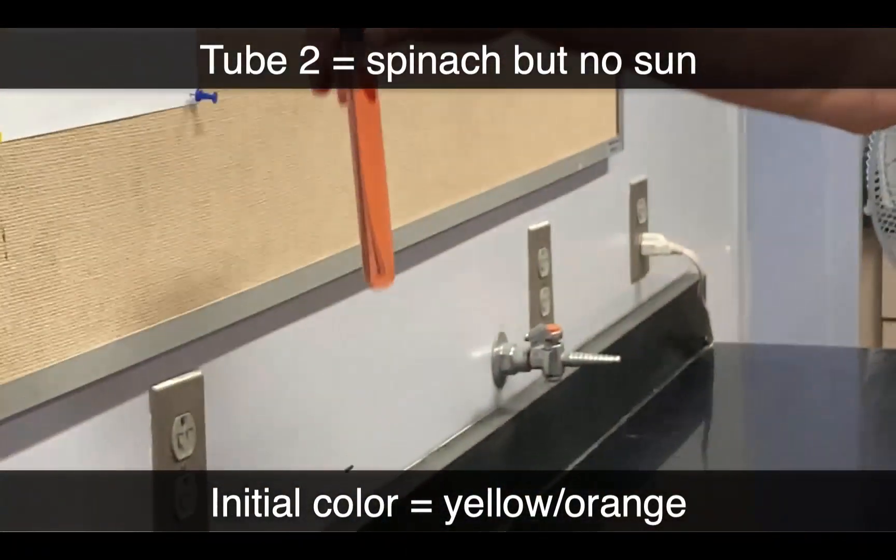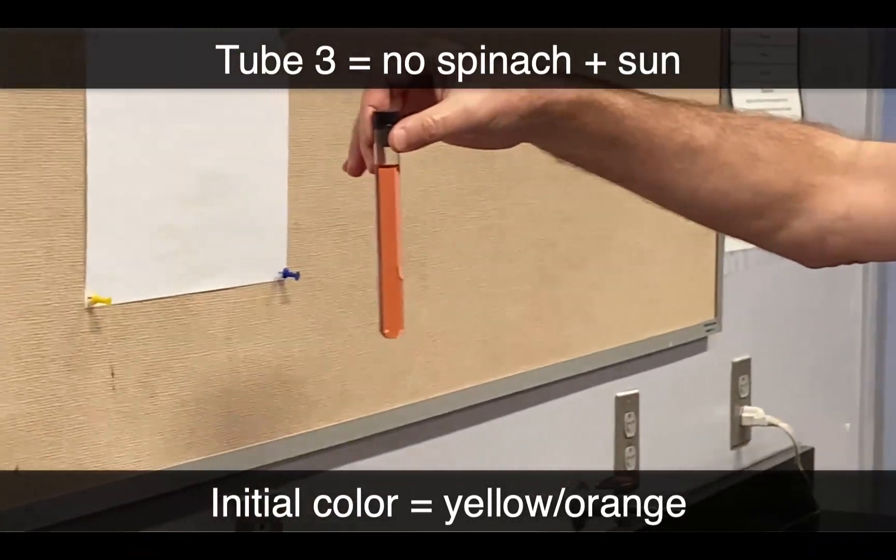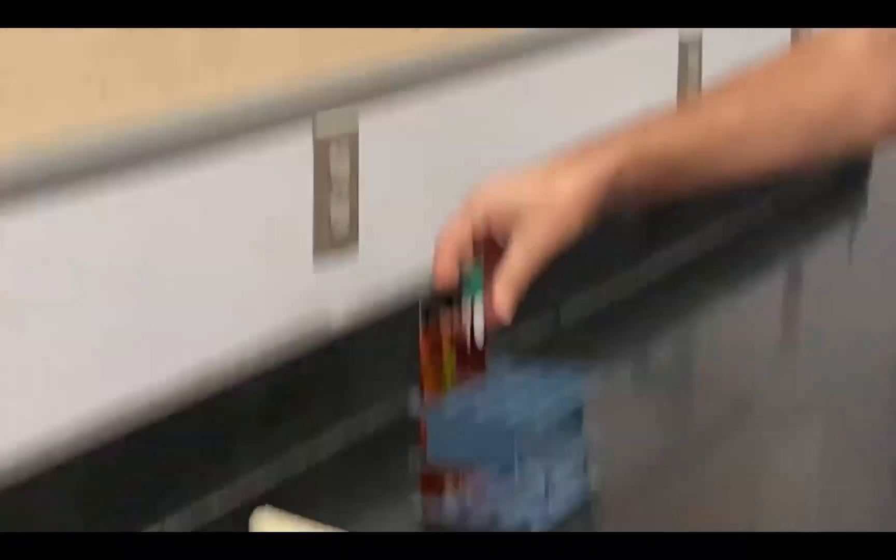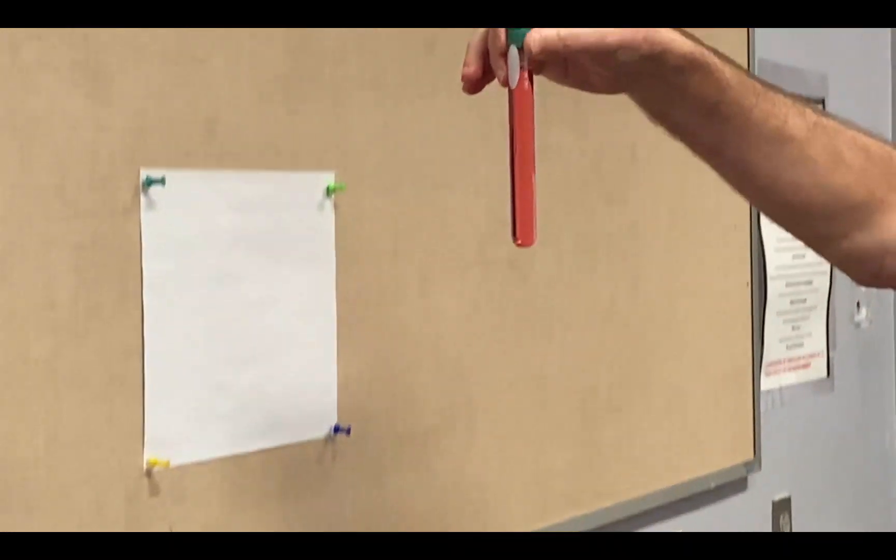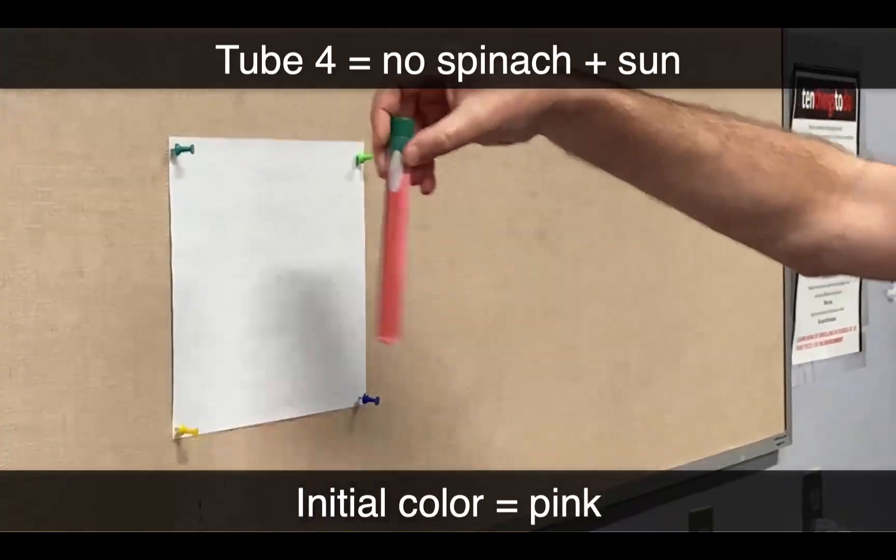Test tube number three received the same yellowish colored phenol red that tubes one and two did. Then we have our original mix of phenol red which was definitely on the pink side in tube number four.